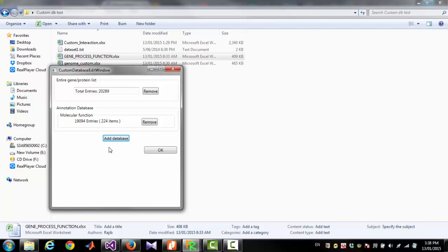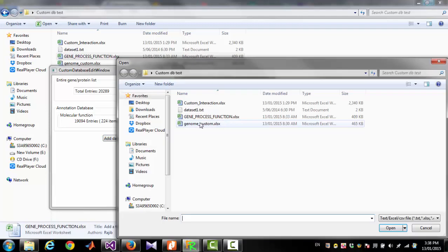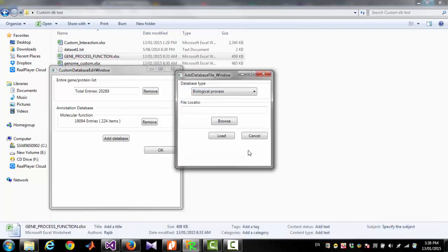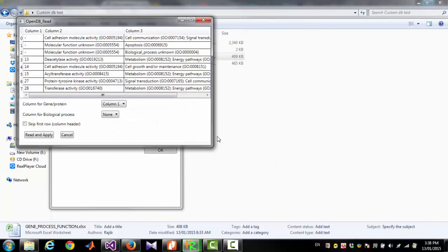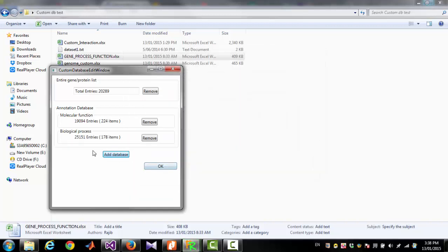I can add biological process from the same file. To do that, I have to click 'Add Database,' select 'Biological Process,' open the same file, and click 'Load.' Now I am going to select the gene or protein column — column one. Biological process is column three instead of column two. Then click 'Read and Apply.' Now you can see the biological process database has been uploaded.